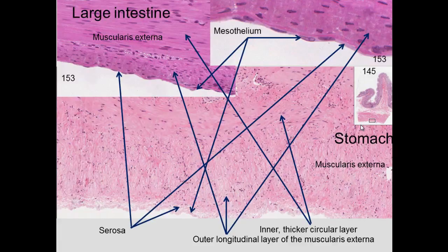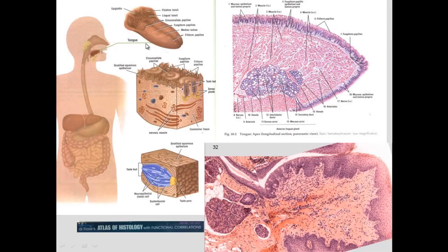Looking at the muscularis externa, the inner layer is circular and the outer layer is longitudinal. You can see that both in the stomach and in the large intestine.